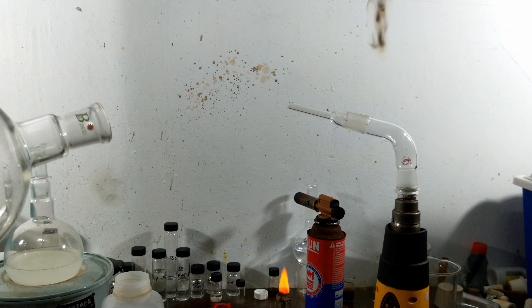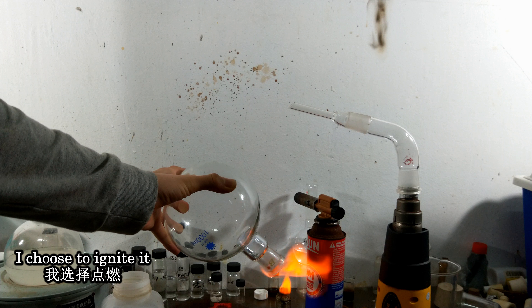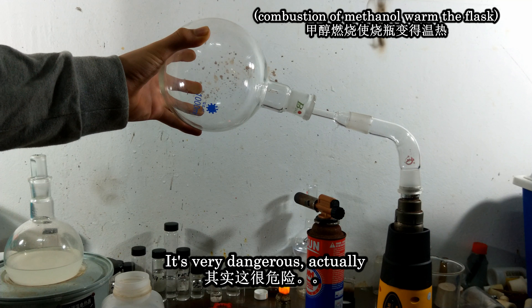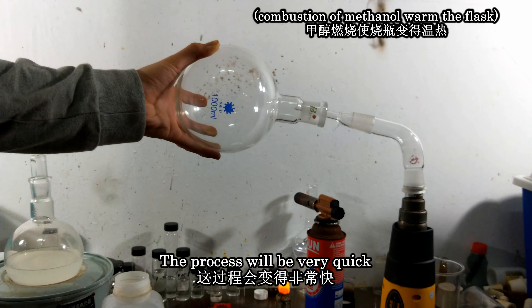This is a hot air gun. I choose to ignite it. It's very dangerous actually, but the process will be very quick.